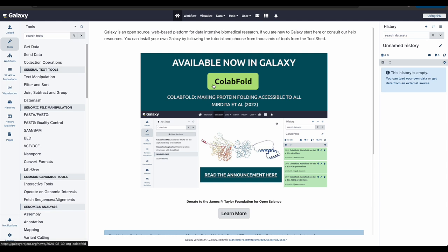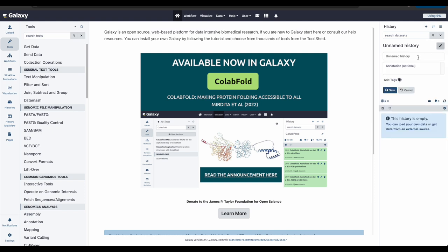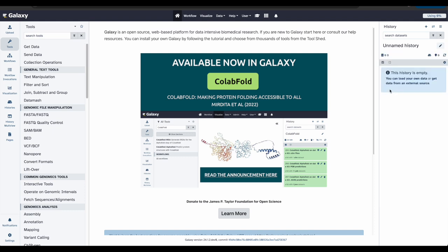Let's start by creating a new history. To create a history, click the plus icon at the top in your history panel on the right. It is going to automatically be called unnamed history. Let's rename the history to something easy for us to identify and find. To do that, we'll click the pencil icon right here, and we can change the name. For this tutorial, let's just call it Galaxy 101. And don't forget to click save.